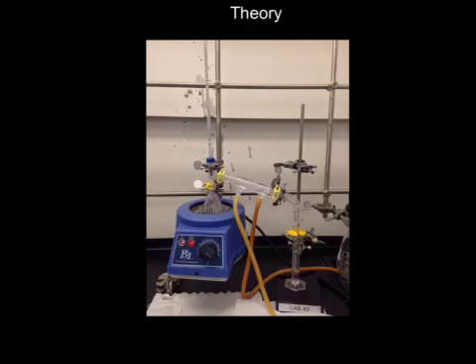The two main kinds of distillation are simple distillation and fractional distillation, and both are used widely, but both have their advantages and disadvantages. Some advantages for simple distillation are that it is faster and less energy consumption is needed, while fractional distillation provides a much better separation between liquid and a mixture can purify better.